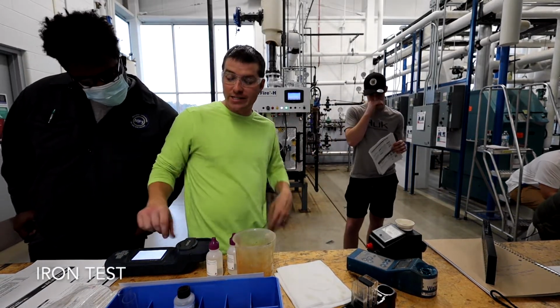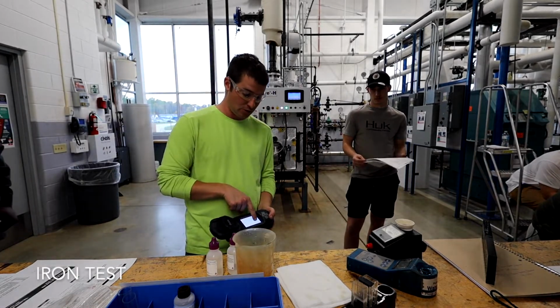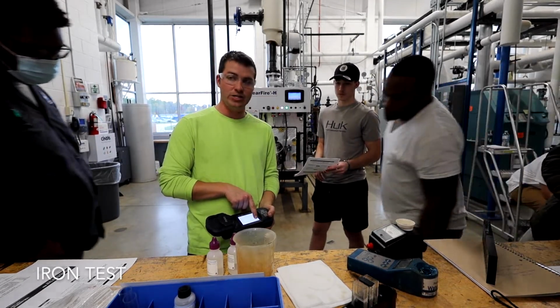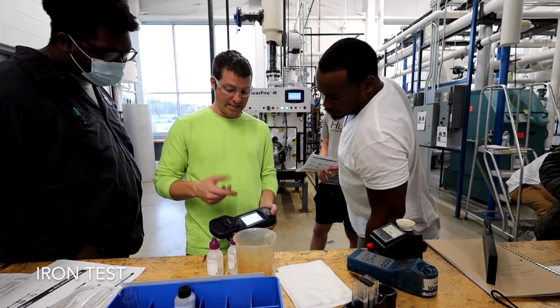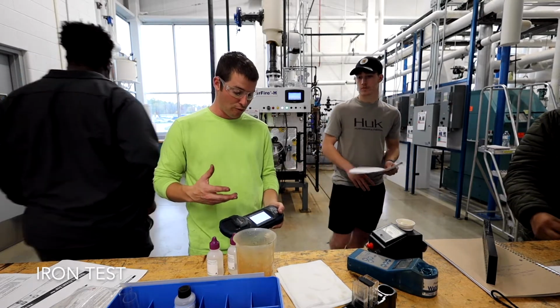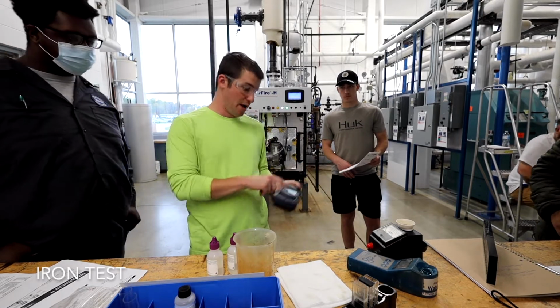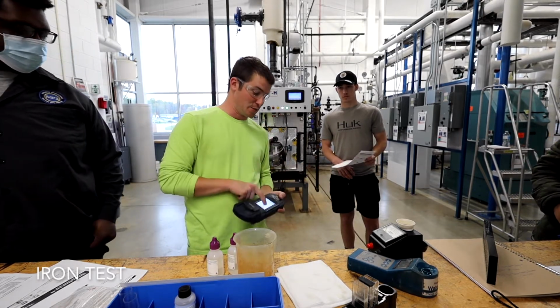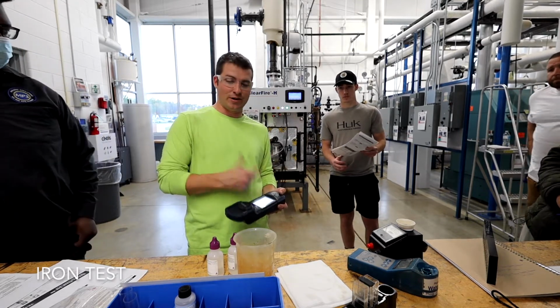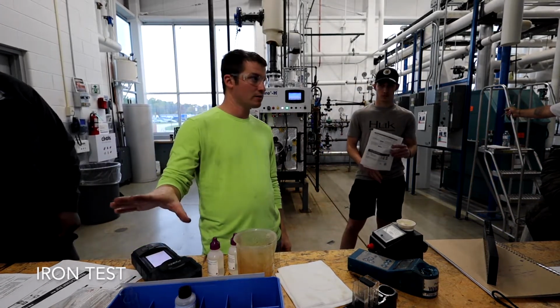So the nice thing about a nice meter like this is, I don't need to wait the full time because it shows me this nice little graph. Once the reading doesn't change for 10, 20, 30 seconds, there's no reason to wait the additional 90 seconds or minute and a half, because it's going to stay around 0.43, 0.44, 0.45. Technically, you didn't wait the 3 minutes. But this meter lets me know right now it's no longer changing, which means it's not going to change anymore. If you don't have this meter, in theory, you don't have a way to validate that, but that is a nicety of having an expensive meter.